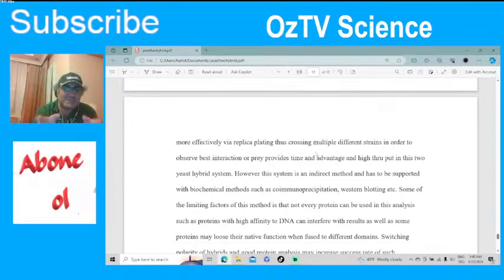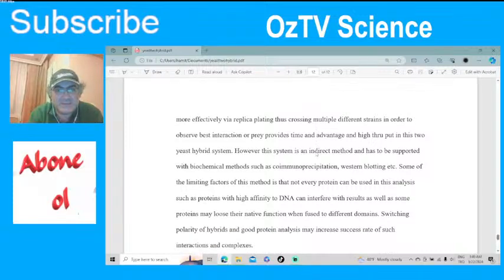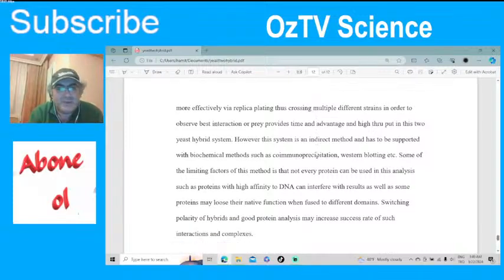See, working with yeast is very, very advantageous. You can work with plasmids, you can work with haploids. Excuse me if I made mistakes or had a hard time explaining it, but the idea is, if you're trying to study proteins, the yeast two-hybrid system is a good way of doing it. You can have your own plasmid, and you can understand those protein interactions.